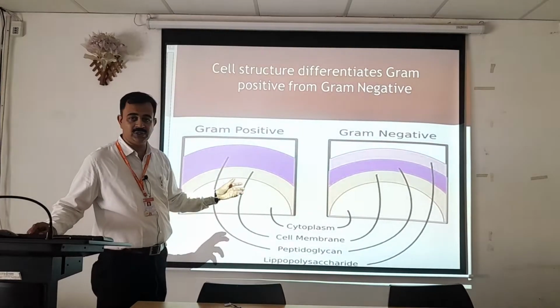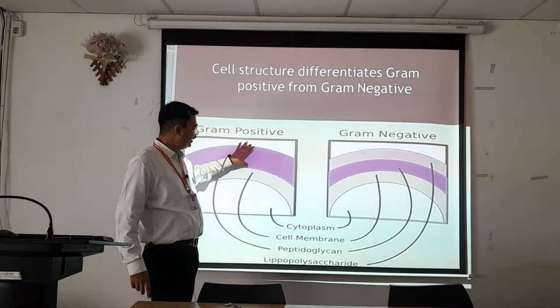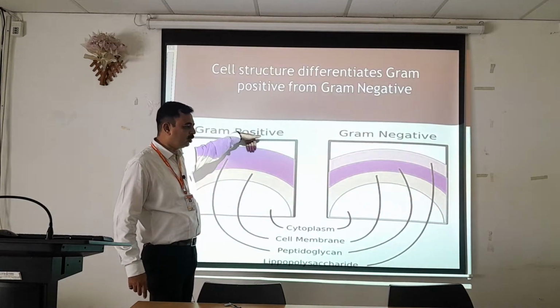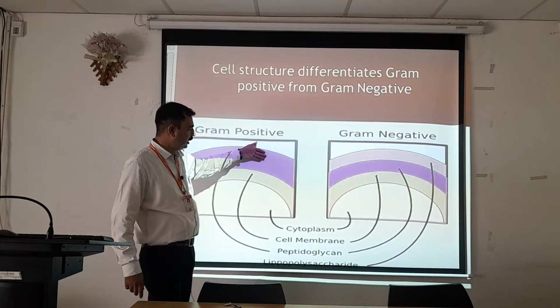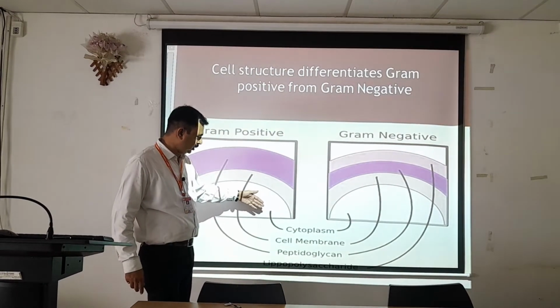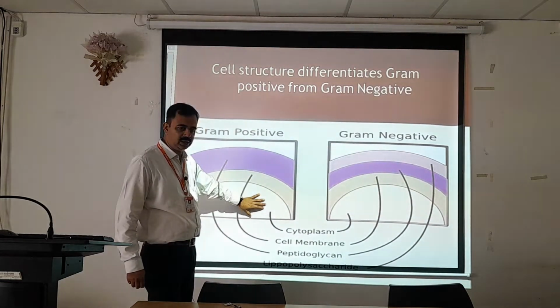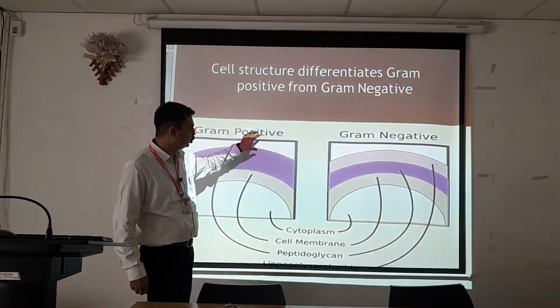ये लेयर का डिफरेंशिएशन देखिए यहाँ पर कैसा दिया हुआ है. See the layer in gram positive bacteria. ये लेयर ज्यादा होने के कारण once you put the alcohol, it will not be able to dissolve the entire layer, and therefore the counter stain जो बाहर में है वो अंदर नहीं आ सकता है. और अंदर का जो क्रिस्टल वाला स्टेन है, even that won't be allowed to go outside.